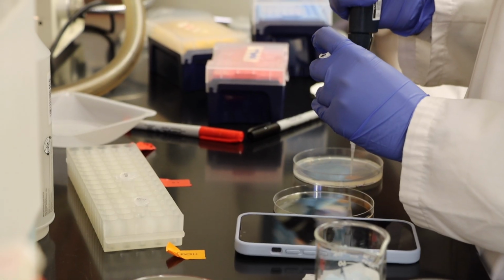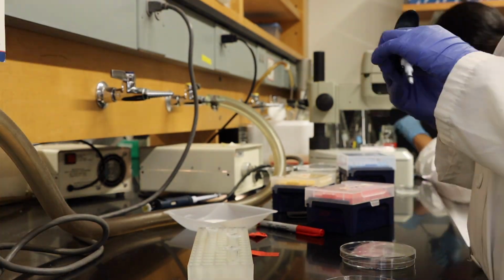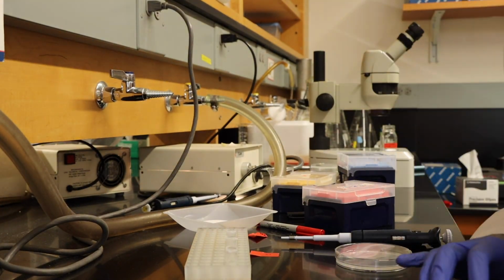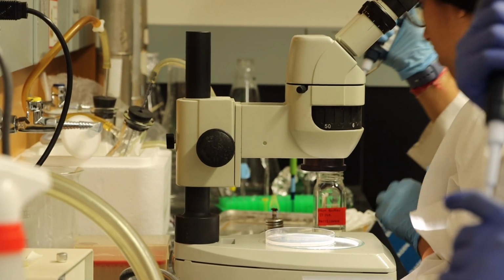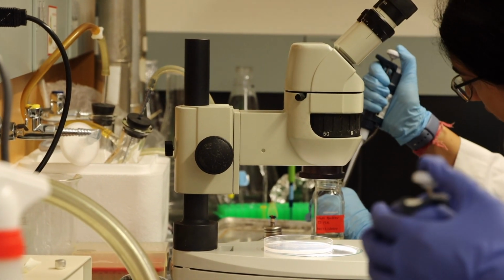The training plate is spotted with 2 dots of isoamyl alcohol, each 1 centimeter away from the midpoint of the plate. This is spotted 10 minutes before the worms are zapped. In the meantime, the worms will be washed. This is done by collecting young adult worms from a plate with 1,000 microliters of NGM buffer. They are then placed in a worm trap.